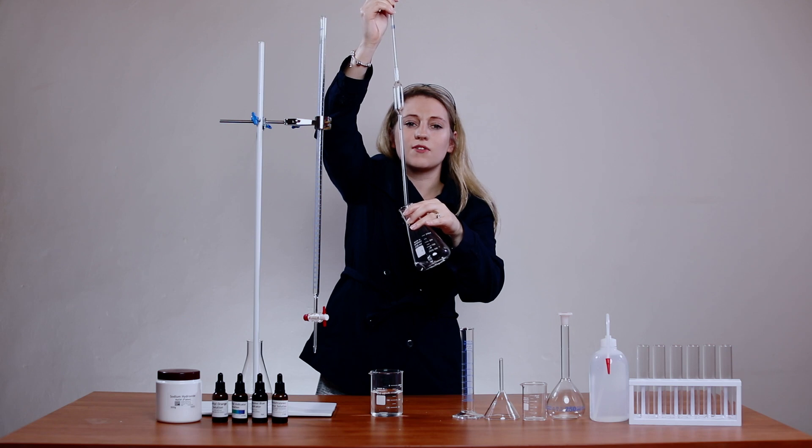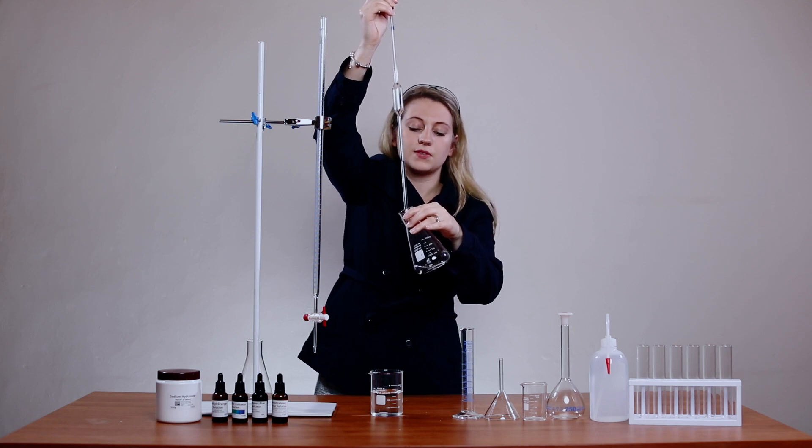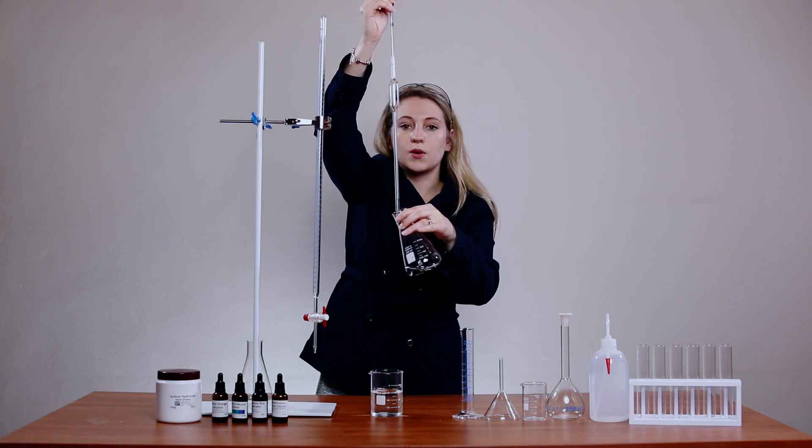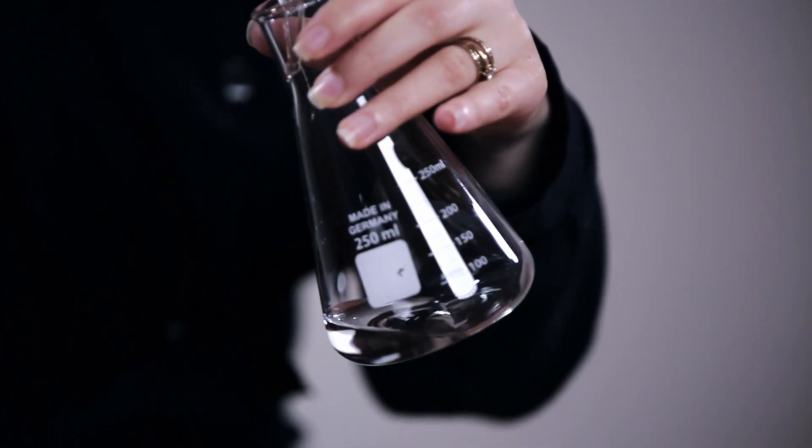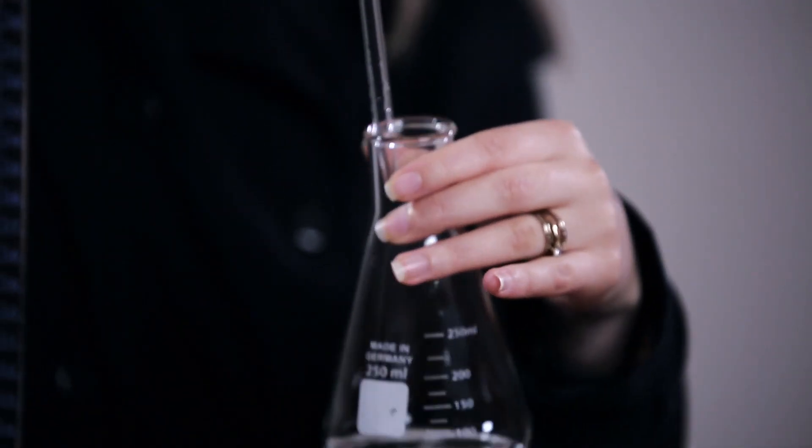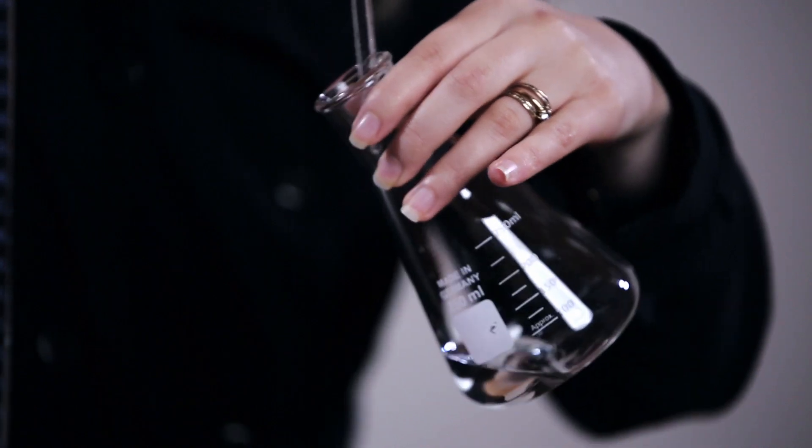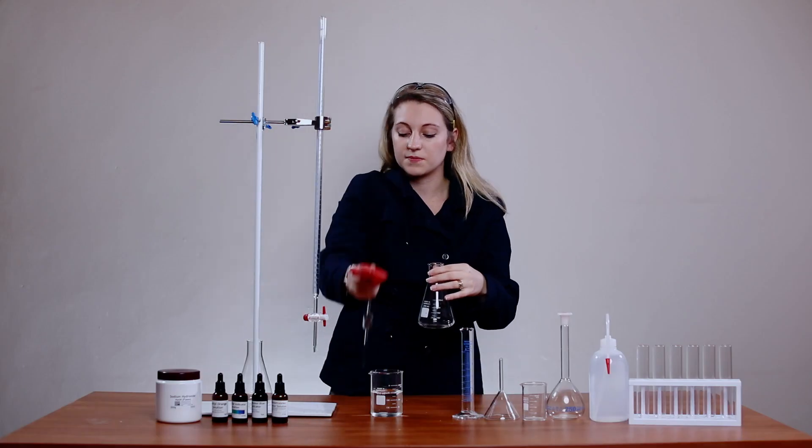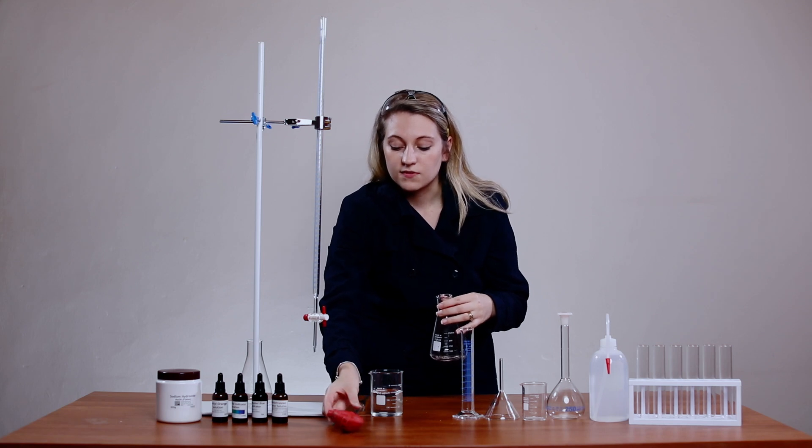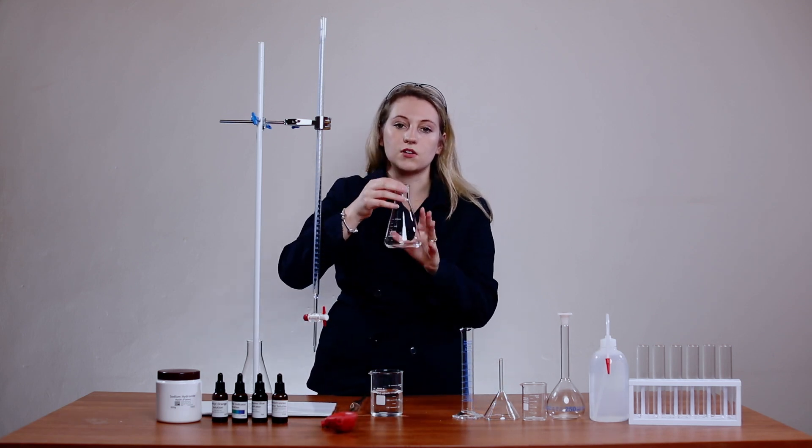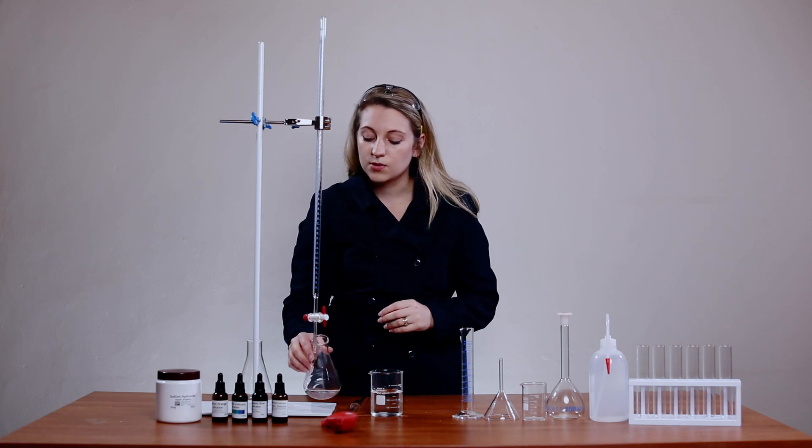You could have used the 25 cubic centimeter measuring cylinder, but when we do titrations we work with the most accurate equipment and that is your burette and your pipette. You just make that last little tilt to make sure that last drop goes into your Erlenmeyer flask. Now you have 25 milliliters of solution in your Erlenmeyer flask which you will place underneath your burette.